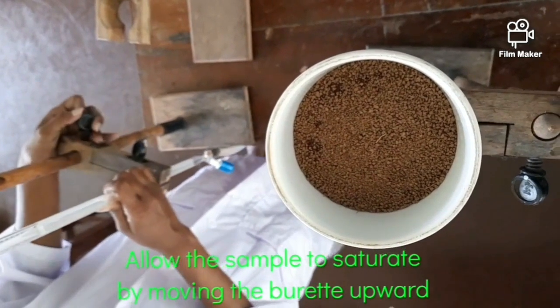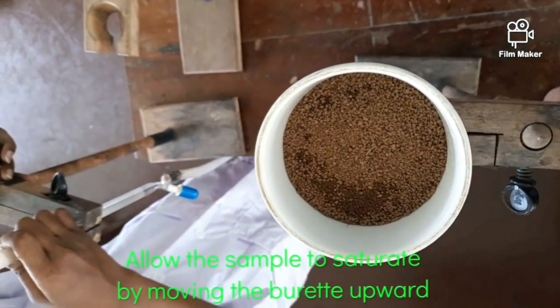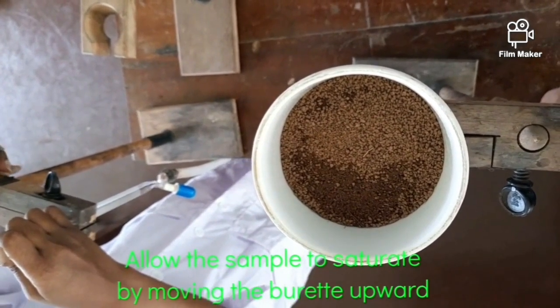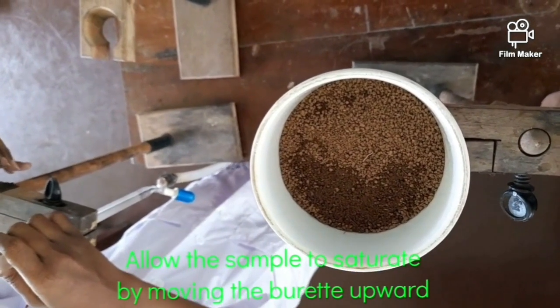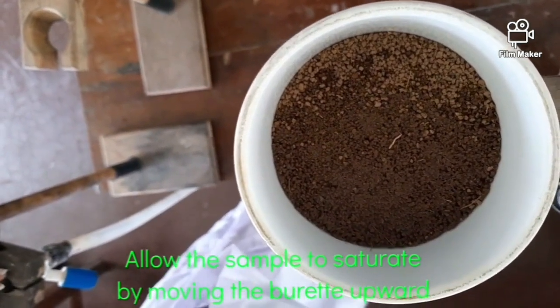Again, raise the burette level. Then you can see the soil in the funnel is being wetted with the water. You have to continue the process until the soil becomes saturated with water. You can identify a thin water layer above the soil stratum at saturation.